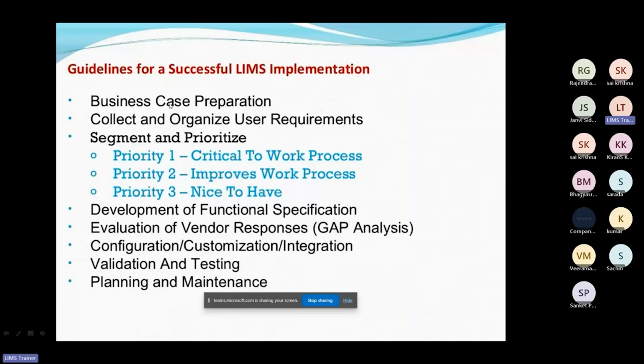What is the need of that laboratory, or what does the industry owner or manager want? Suppose there are 10 HPLC systems, two dissolution apparatus, two weighing balances, one UV. Accordingly, we have to design and calculate what is required and how much the budget will be for that laboratory.